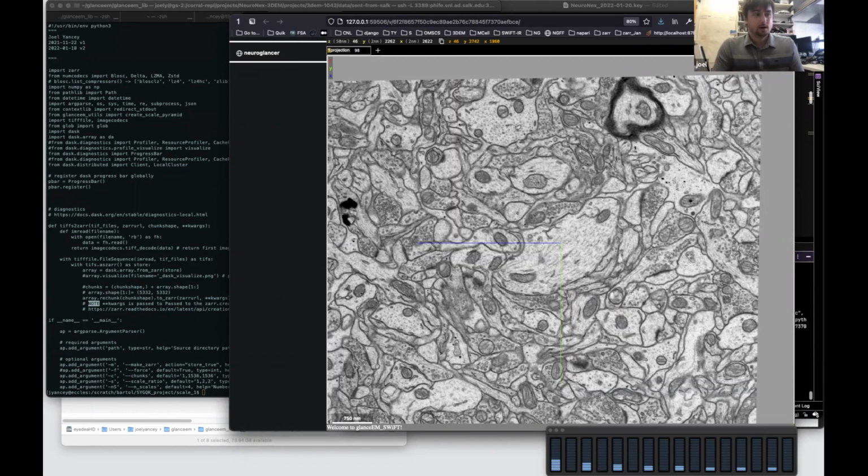When I demonstrated how you can start to configure this with different window panes and stuff, the customizability of the Neuroglancer Python API is very limited. So the alternative course of action is to fork the Neuroglancer code and start from there.